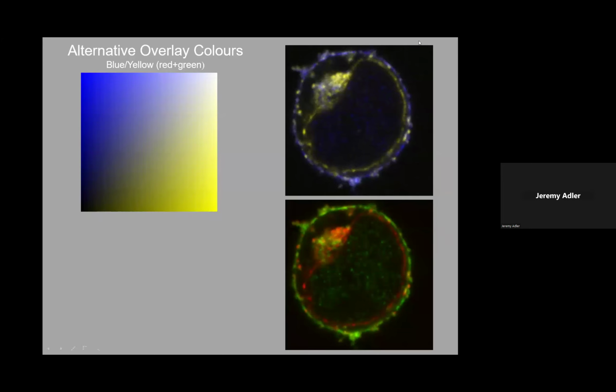Alternatively, in displaying, there is some push now to use blue, maybe blue and yellow, to help out the small group of men, about 5 to 6%, who have problems with red-green discrimination. So maybe blue and yellow work for you.